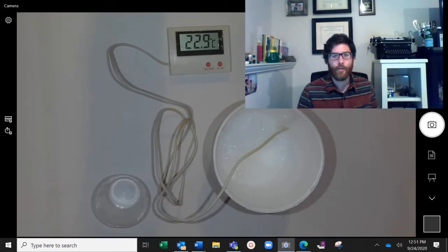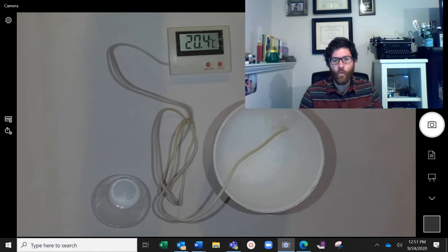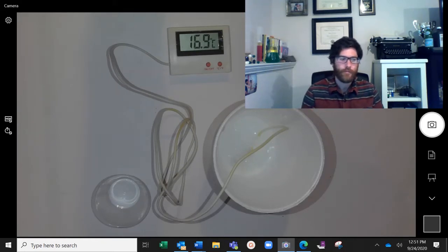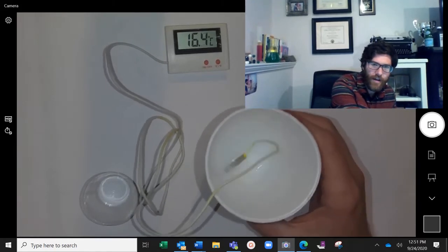Okay, here we go. We are in the middle of the reaction. Go ahead and note what is happening. Note what matter you see. Okay, give a full description of that in your data table, and also notice what's happening to the thermometer. Okay, we're measuring the temperature and we might see some changes there. Okay, you can see that the reaction is starting to slow down. I'm going to give it a little swirl to make sure everything comes in contact with everything else.